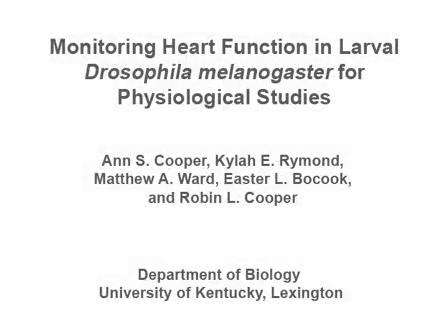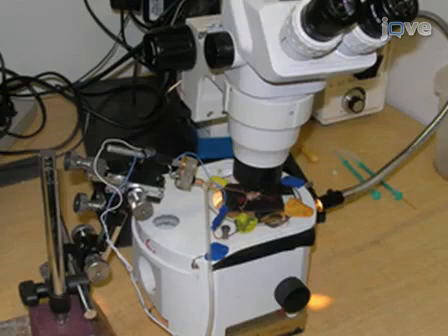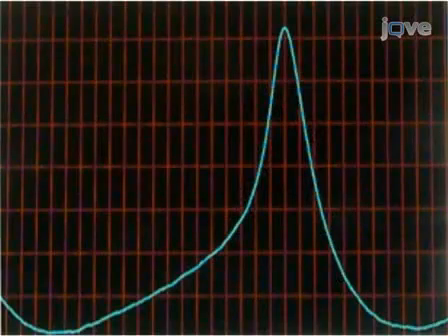Drosophila are genetically attractive for investigations of the development and function of the heart and underlying pacemaker activity. This procedure shows how to make preparations of both intact and dissected larvae, and how to monitor heart rate. The dissected preparation also allows recordings of extracellular or intracellular potentials to further access ion channel function.